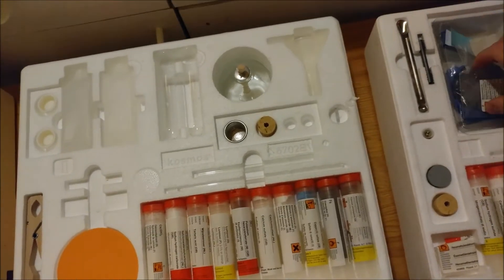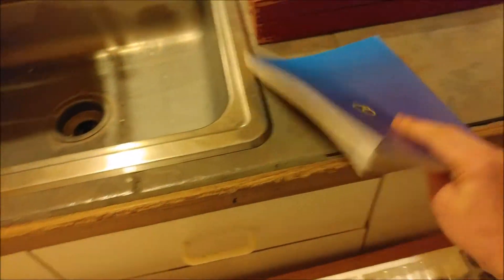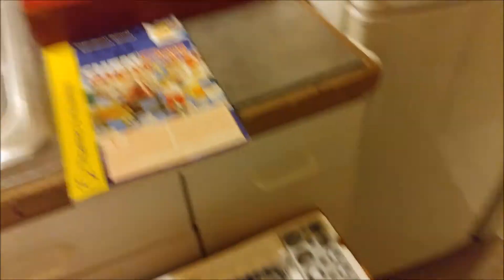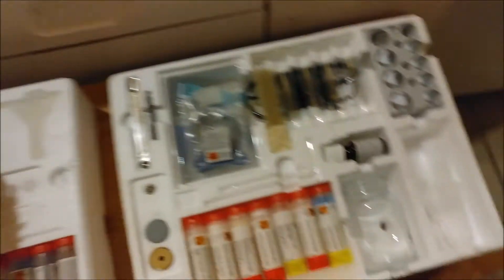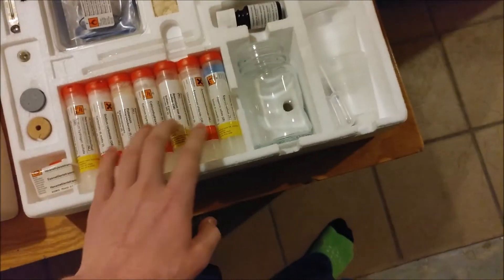The experiment book has about 400 experiments. I got to page 100 and only found three or four that interest me, but I'm sure later on there'll be more that catch my interest. There are a few experiments I couldn't do because I didn't have hydrogen chloride on me at the time. Here's an alcohol burner — you put ethyl alcohol in it, and that's another reason I haven't been able to do much; I haven't been able to get ethyl alcohol.